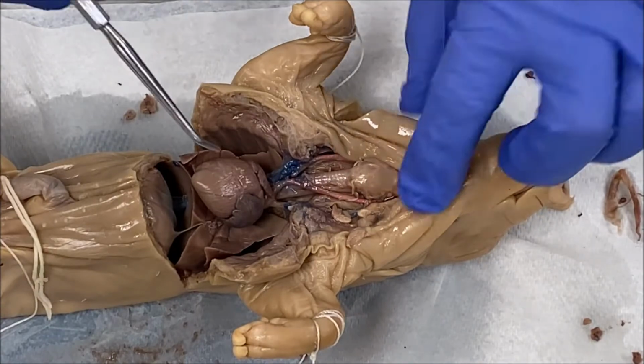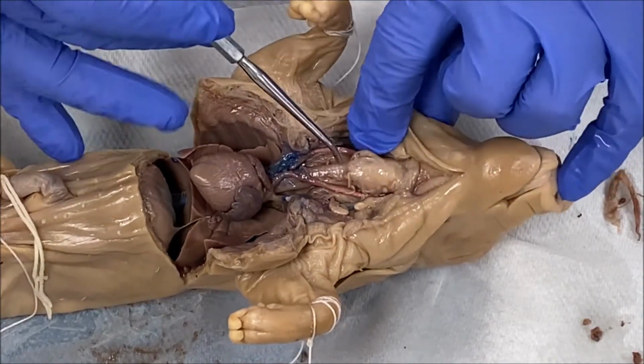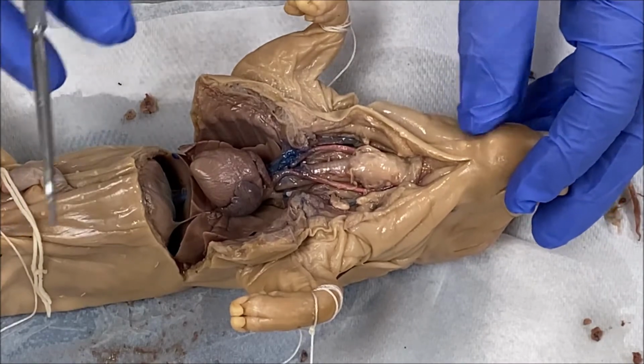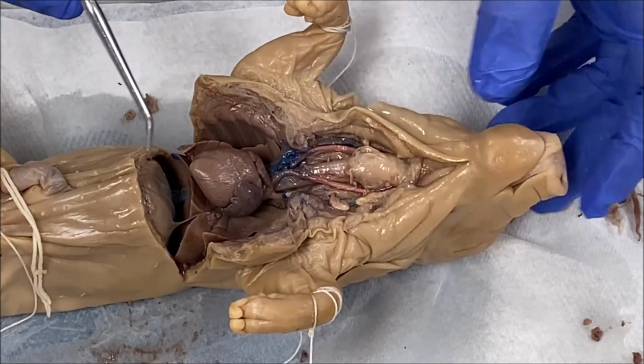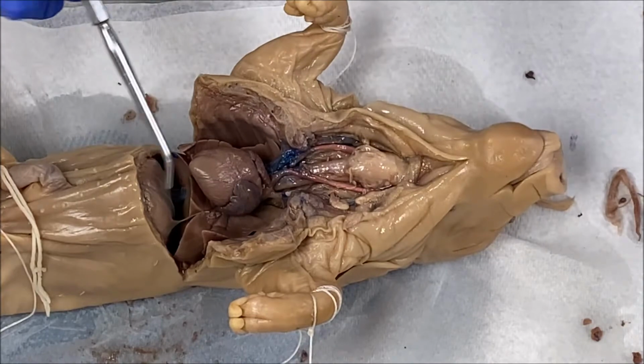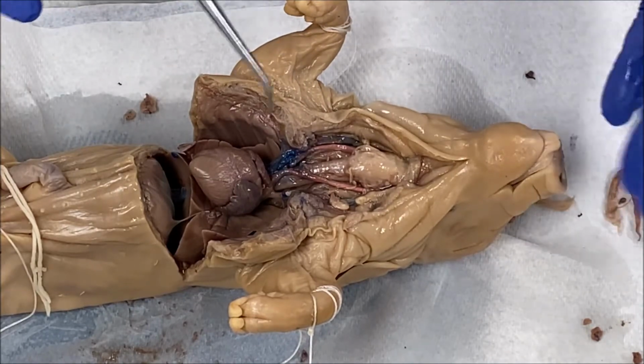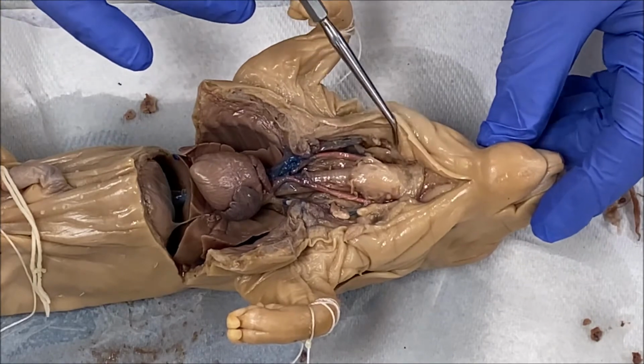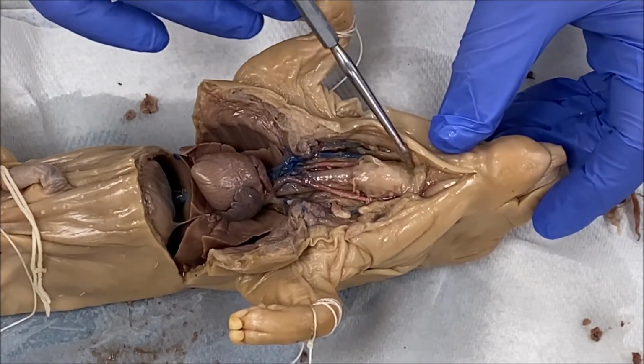So we're going to go ahead and begin the identification. The structures of the respiratory system that you are going to be responsible for are the internal structures. We're not going to worry about the nostril, the nose, or the nasal cavity, or anything like that. But the first structure of the respiratory system that you need to identify is this right here.